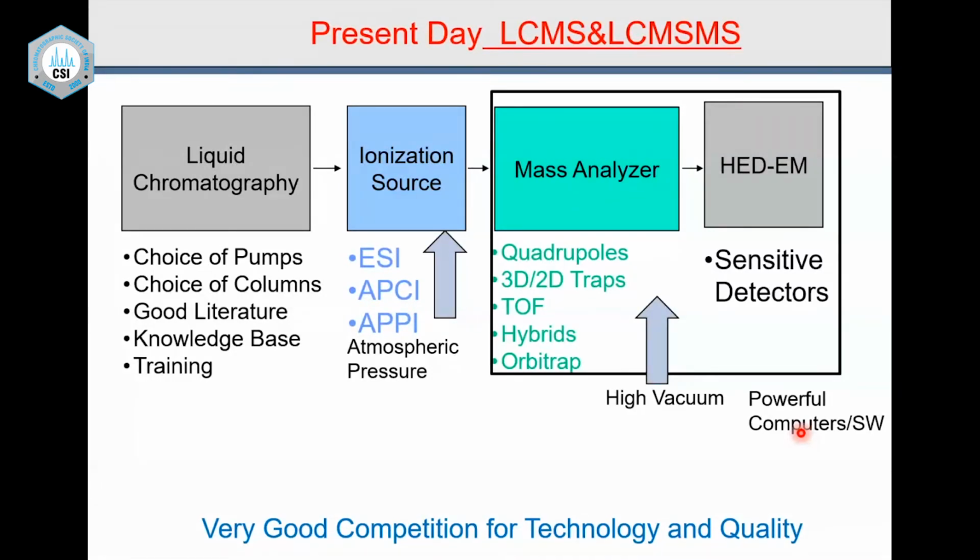So you must remember that in the LC, some of these mobile phase solvents can be very expensive. So one of the challenges is how do I reduce the flow of this mobile phase? There are HPLCs with smaller diameter columns and shorter length columns, but with the same efficiency that you would get with the bigger columns. That is the way it has really improved, and that is why you have HPLC and UHPLC, etc.